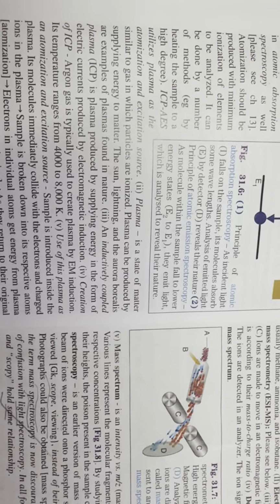To create an ICP, argon gas is typically used to create plasma by electromagnetic induction. The temperature ranges from 4000 to 8000 K, and this plasma is used as an atomization and excitation source. The sample is introduced inside the plasma. Its molecules immediately collide with the electrons and charged ions in the plasma. The sample is broken down into respective atoms.